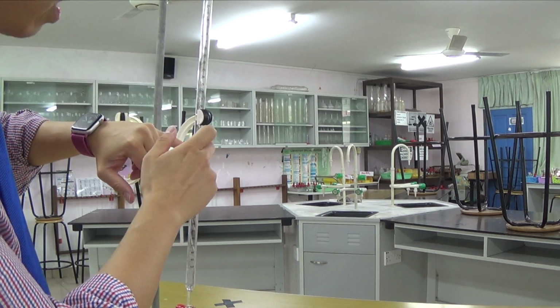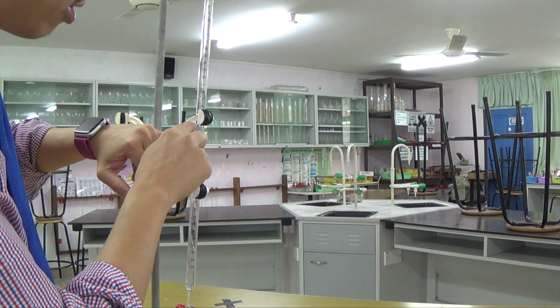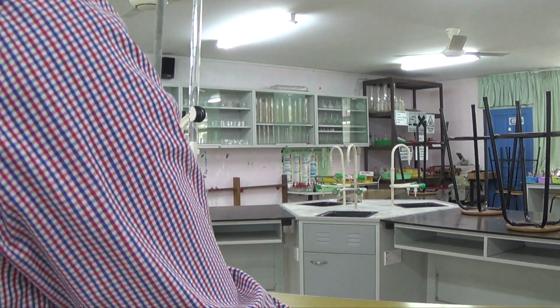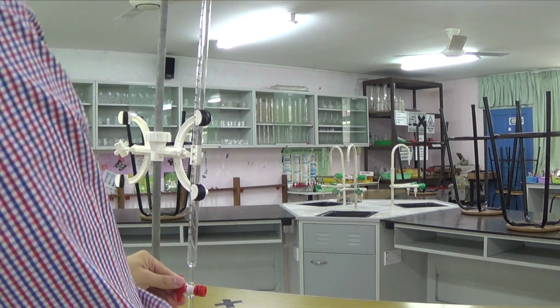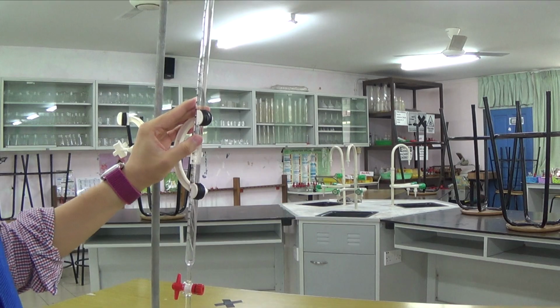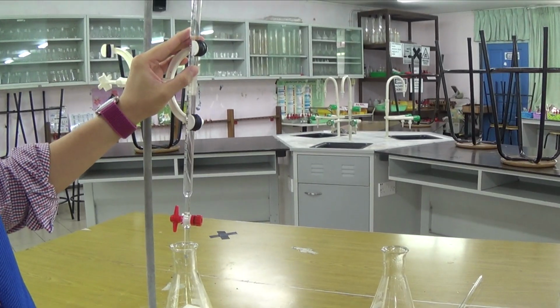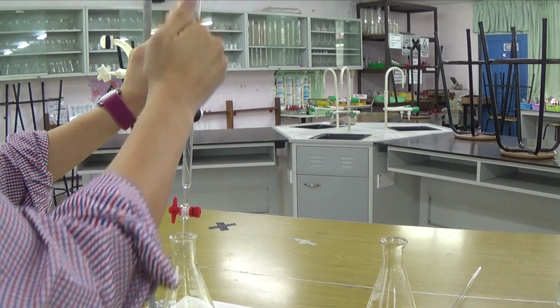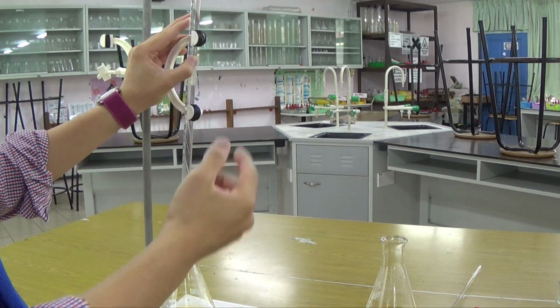But I don't want to stop there because there's excess. I will slow down around 30 cm3. So I will let it flow until it reaches 30 cm3. Okay? So 30 cm3 is around here. So I let it go, free flow. I don't even have to swirl it or anything until it reaches 30 cm3. That is way before it is in excess. Then I will do it drop by drop.